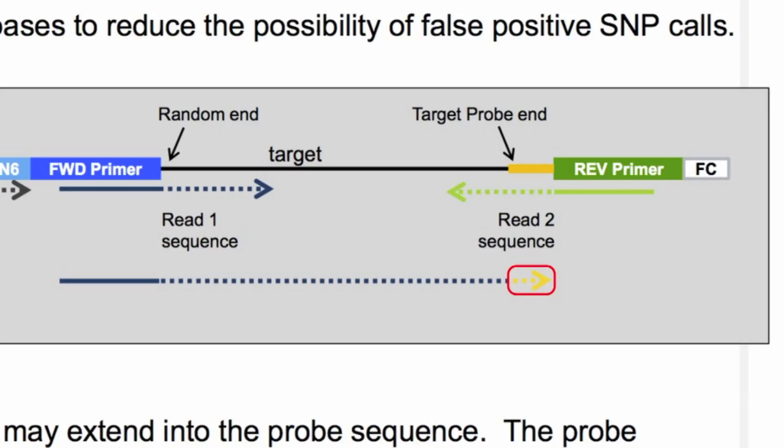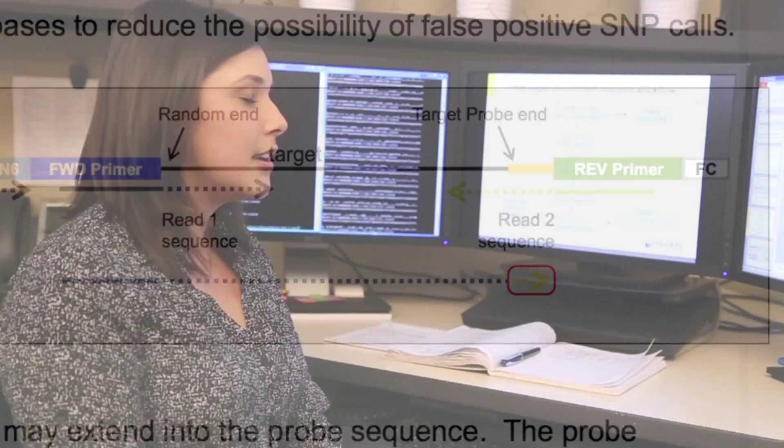Next, we use BBDUCK to remove the probe sequence from the end of the forward read. This will ensure that we do not falsely call SNPs where the probe sequence lies.